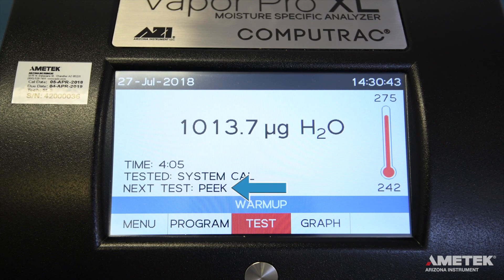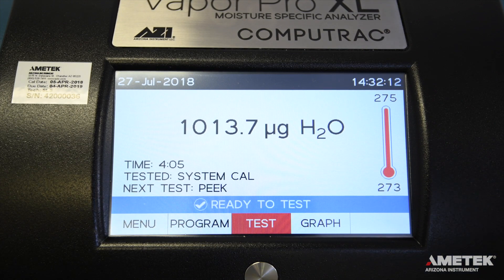On the home screen, you'll see that your new program is now listed next to Next Test. The thermometer has likely changed as well, showing either a higher or lower number at the top. The number on the bottom shows the current temperature, while the number at the top shows the objective or test temperature. Once the instrument has heated up or cooled down to the appropriate temperature and the screen reads 'ready to test,' you can begin.